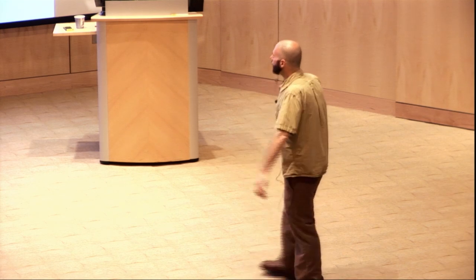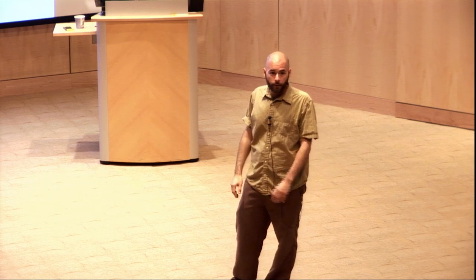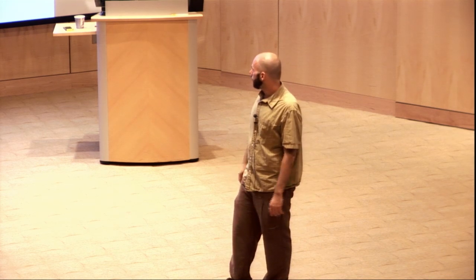Good? Okay, and so you'll have a billion things in the record, and so your file size will be a billion times 4, right? It'll be the number of reads times 4, because there are 4 lines per read. That'll be the size of your file. It's just an ASCII file. You can cat it, you can grep it, you can do anything you want to it. And that's it.